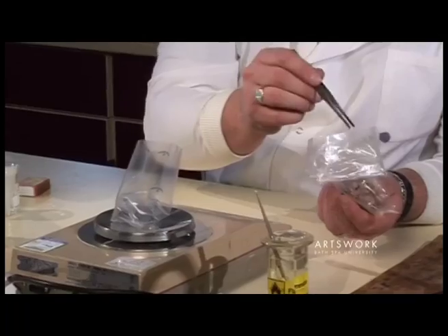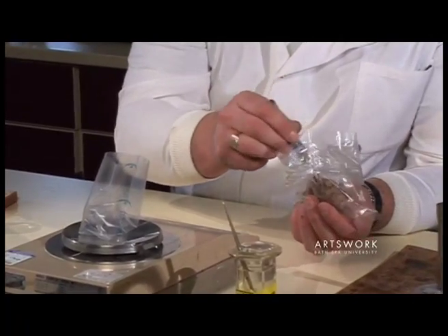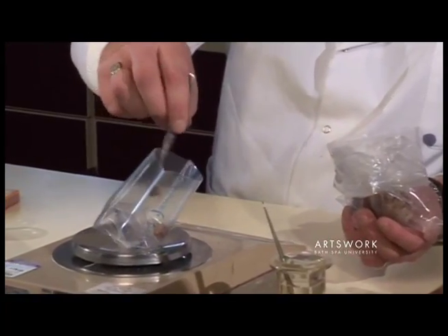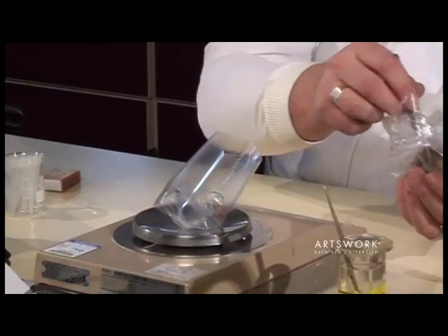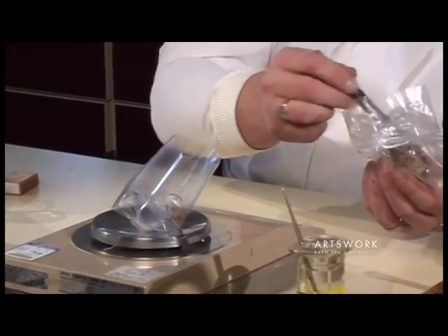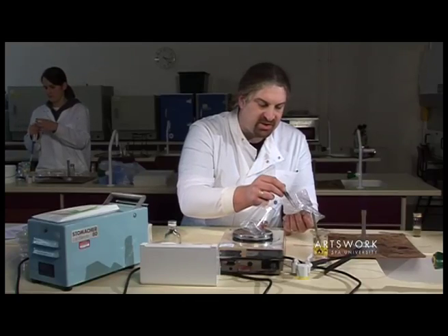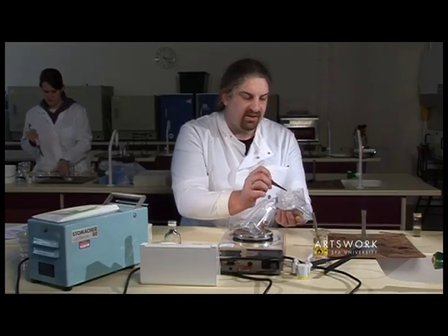Once that's done, into our sample, take out five grams. You need to weigh that to an accuracy of 0.1 gram either way.